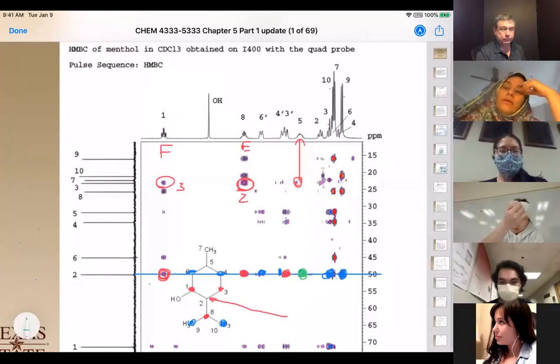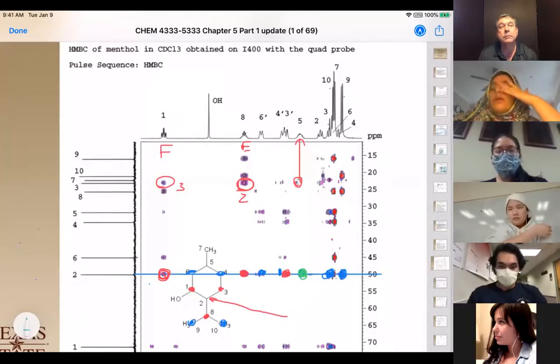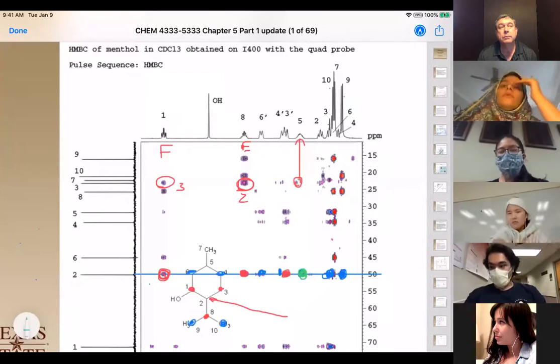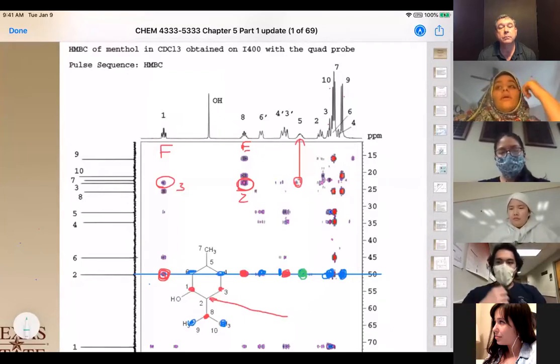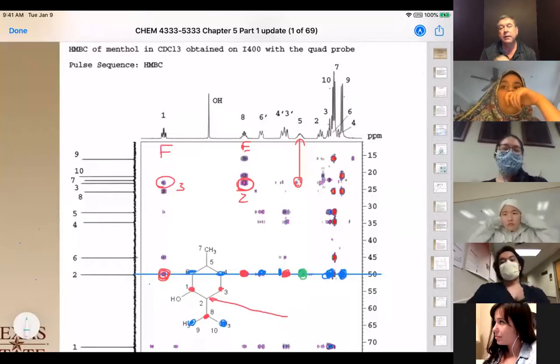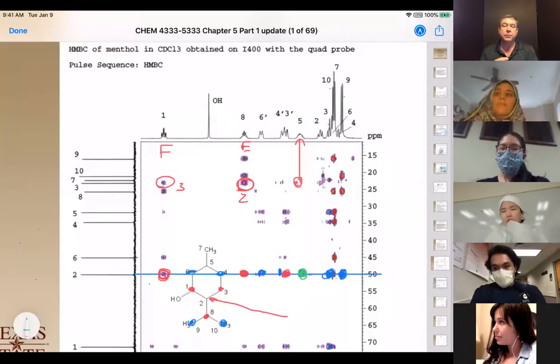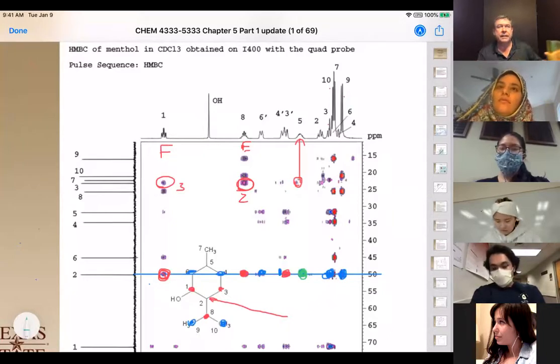Okay? And the other question is, when we are using the carbon spectrum, we're only correlating the carbon-carbon ones. And when we are using the proton NMR, we will be correlating only the hydrogen and hydrogen. So if we're doing the COSY proton or carbon NMR, then yes, it's just a direct carbon-to-carbon correlation. This is the HETCOR, where we're showing where the combinations between the hydrogen and carbon are. Did I answer that question? Was that what you're asking?